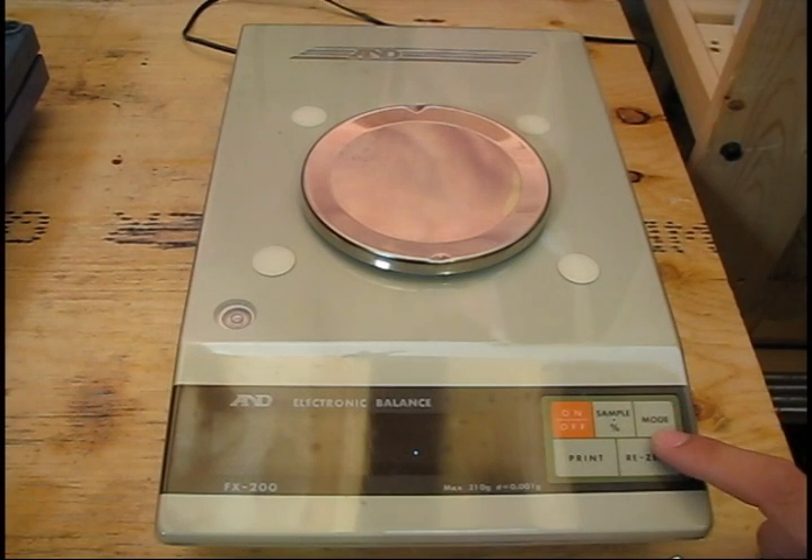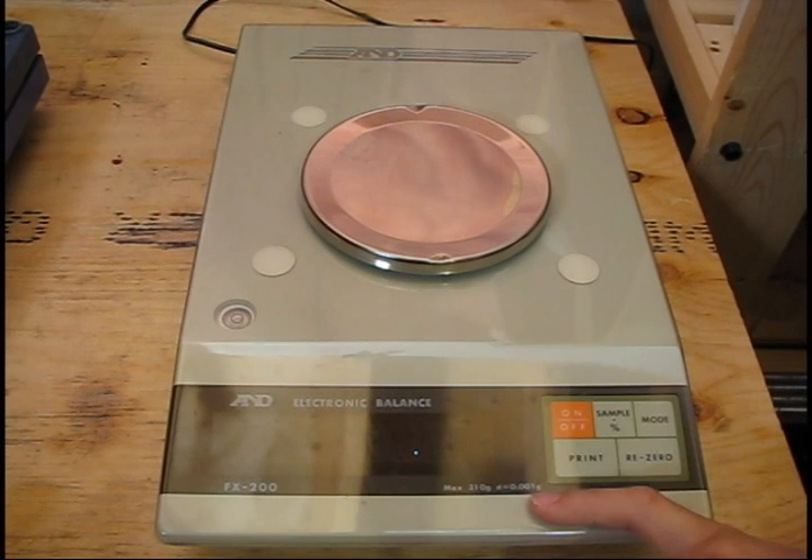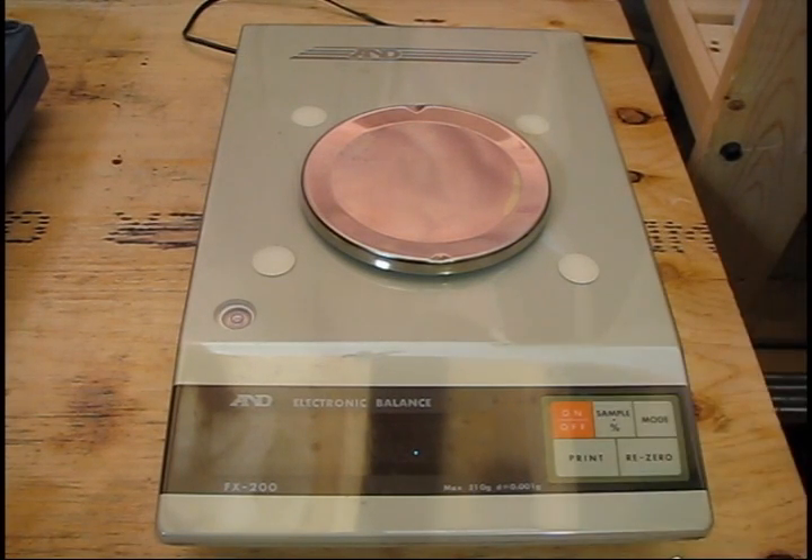The ones you need to worry about are just these three buttons: the power, the mode, and the zero button. All balances will tell you what their capabilities are — their capacity, which in this case is 210 grams, as well as their resolution, which is 0.001 grams. The good analytical balances will give you a range of error, for example plus or minus 0.001 grams. Not all balances will have this, but the good ones will.